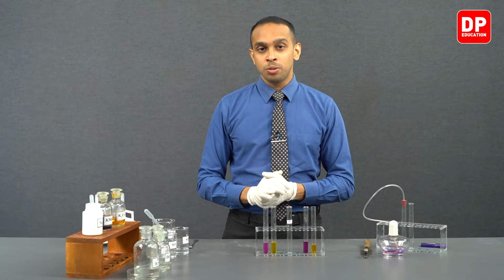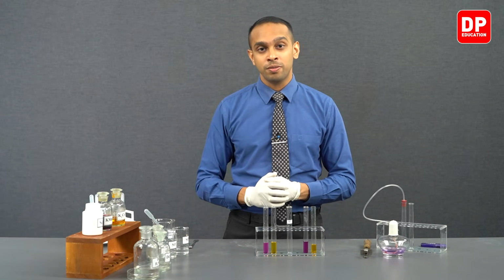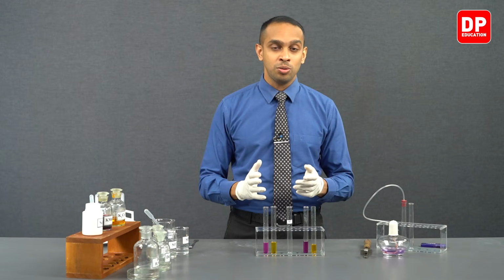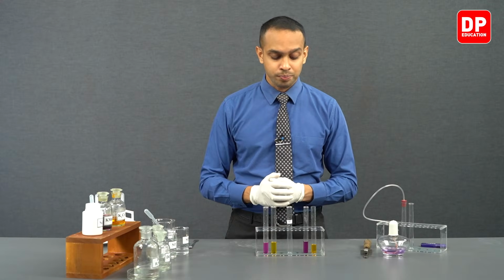After diluting these two oxidizing agents, we can now take a sample of sodium sulfite into our test tube and add it with HCl. To make this reaction happen a little faster, we can use a spirit burner and heat up the reaction mixture so that it produces sulfur dioxide gas a little faster than it would when we conduct this experiment without heating it up.